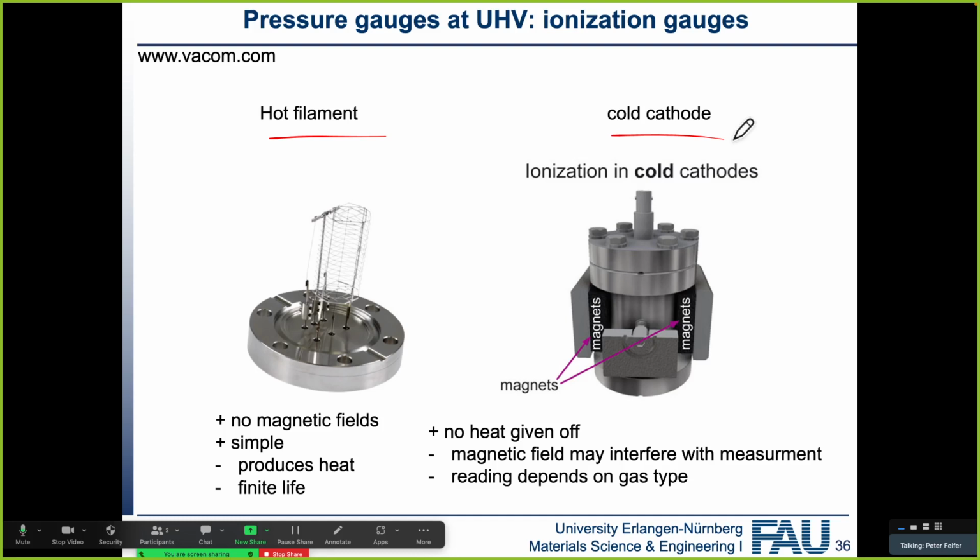So it's not a mechanical gauge like a Bourdon gauge, the Bourdon manometer that you know from, I don't know, your regular vacuum equipment, where you just have the dial, or for example the high pressure equipment. Our 1000 bar systems, for example, use mechanical gauges. But here we've got ion gauges. Essentially, we ionize the residual contaminants and measure the current that they produce.